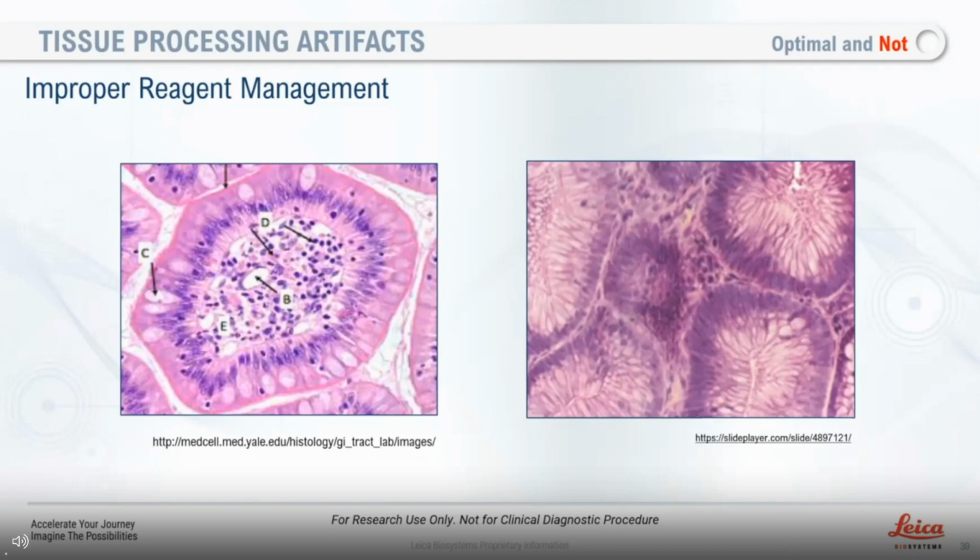This is a great question, and one I would definitely want to ask a few more questions about. Telling me that your eosin staining is fine, but not the front end of your hematoxylin staining, tells me it might be an issue with your stain line and not your tissue processing. But I would need to look at a slide and talk to you about the steps.